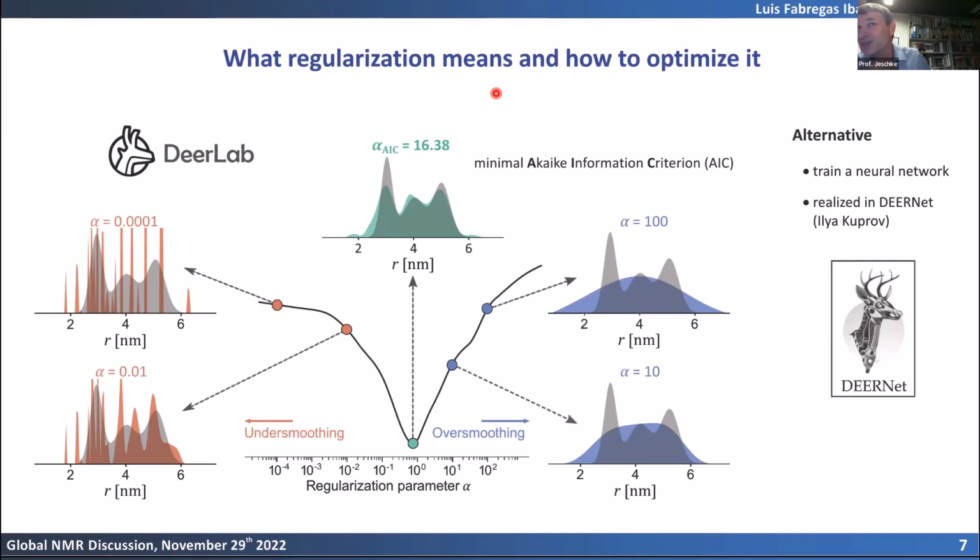This is also one of the reasons why we don't use these distance distributions so much to make structures of ordered proteins. Even if you cannot crystallize an ordered protein, even if it's too large for NMR, a structure that you could make by EPR distance restraints would be worse quality than a high resolution structure that you could make, for instance, by cryo-EM.